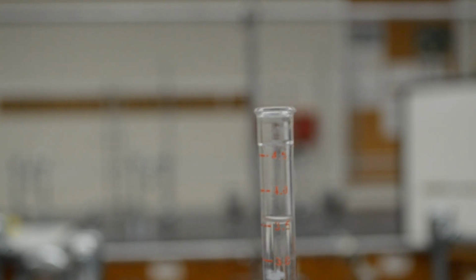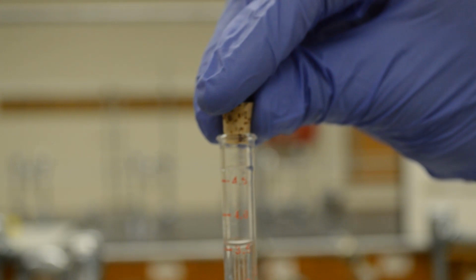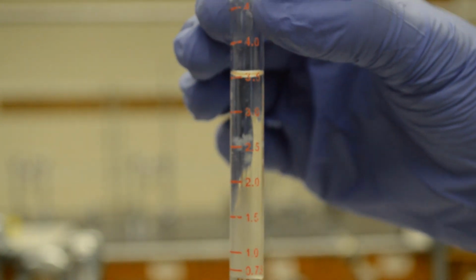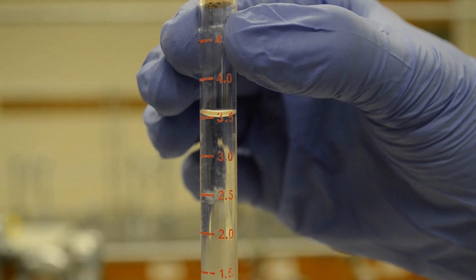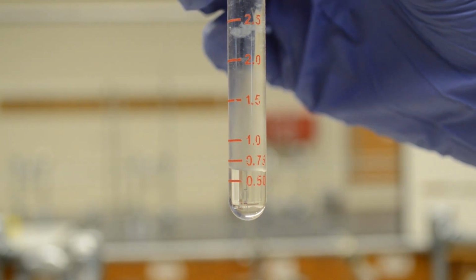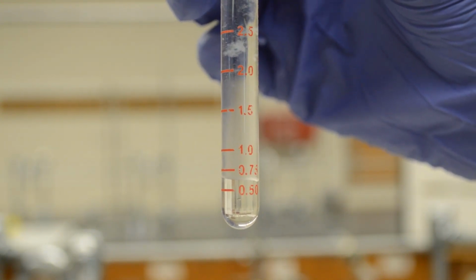I have the product in the test tube. It does smell like banana. I can't stand that, so let's put a baby stopper. The overall volume of the aqueous and organic is 3.6 ml, and the bottom aqueous layer is about 0.7 milliliter.